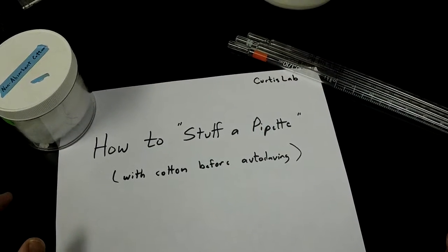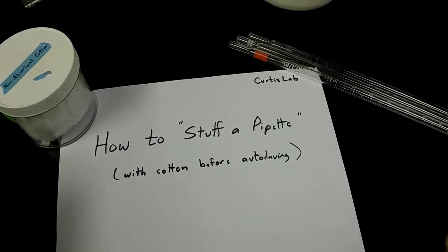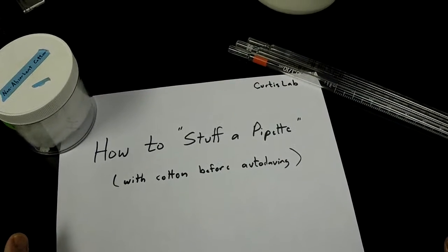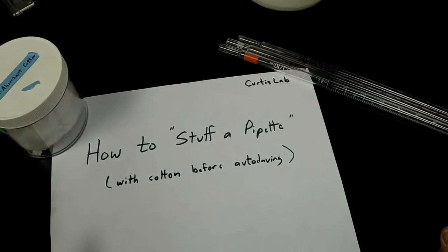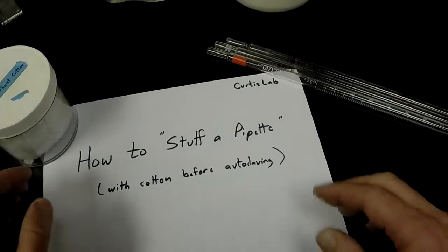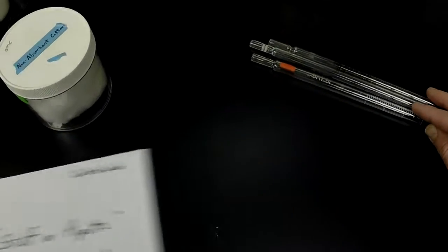Today's activity is one of those mundane lab activities that's often done wrong: simply how to stuff a pipette. If you're going to autoclave them and use them for sterile liquid handling, you'll want to do this correctly.